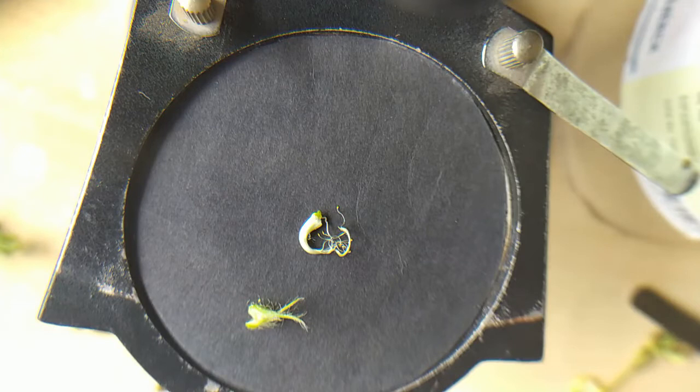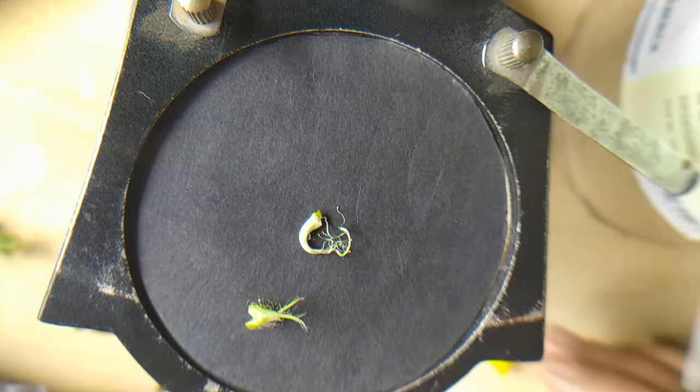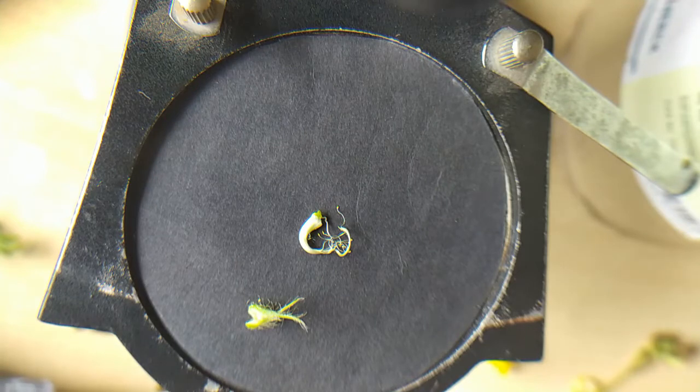Good morning. Today we are going to start the dissection of urad bean and mung bean. As we know, the flower morphology, flower structure and appearance of urad and mung are similar. Only there is a difference in taste and stickiness; urad grain is more sticky after cooking, but this stickiness is not observed in case of green gram.